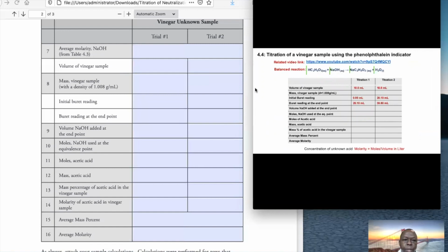Titration, just like in part A: initial volume, the meniscus was at 0, and then it dropped down to 20 ml, and boom, the color changed from colorless to faint pink. The instructor had to stop the titration.